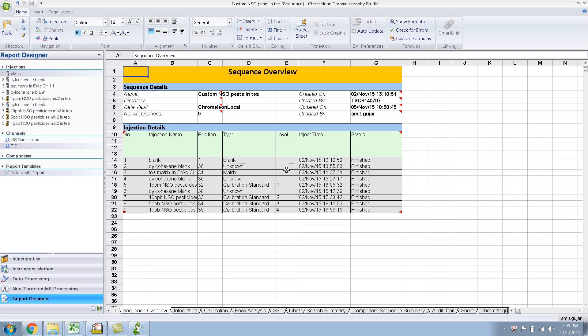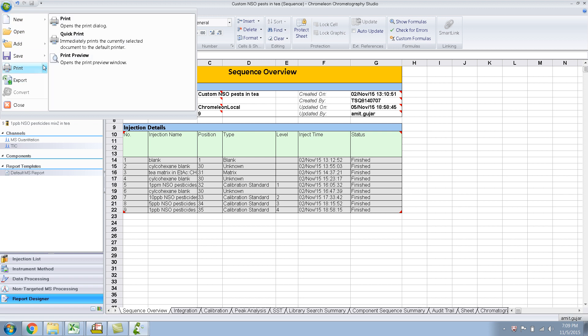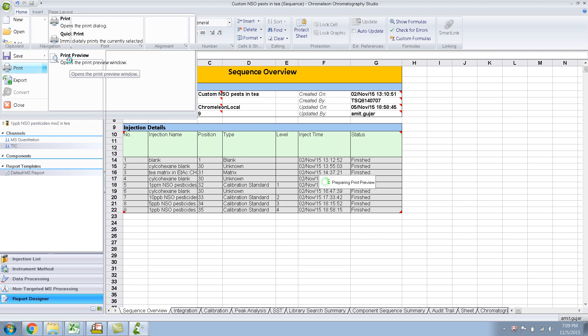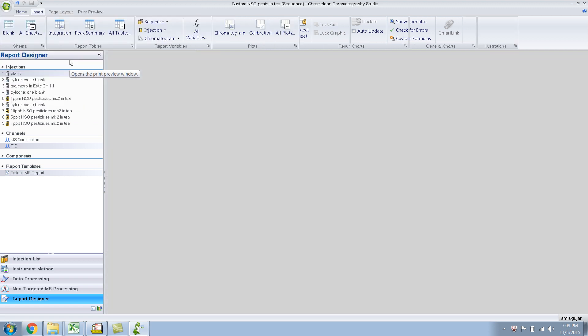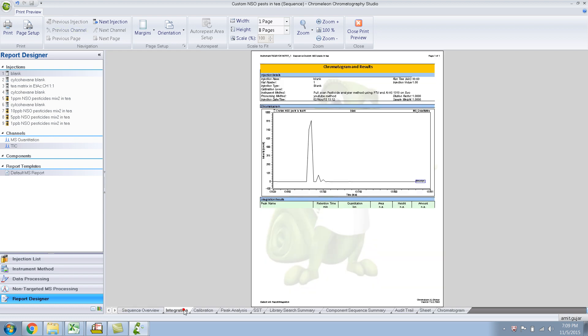Okay, so this is the Chromalian report and if you go and try to print it, I'll do a print preview. You'll see that in each and every page of the report, you have this Charlie, Charlie the Chromalian as a watermark.